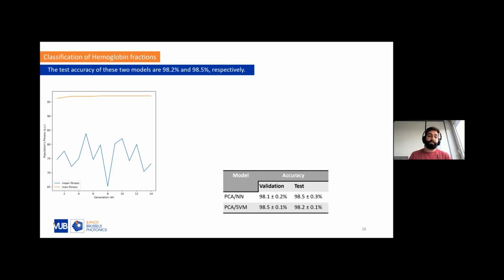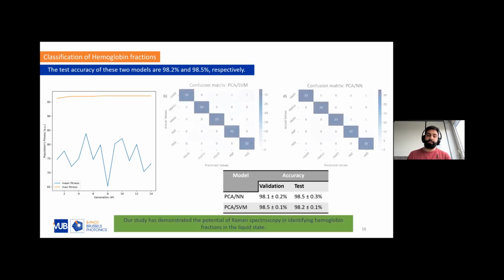So that's the case for the optimization of the models, and you can have as many models as you want, and you can have any conditions on your hyperparameters as you want. You could have text hyperparameters, integers, floats, continuous ranges, discrete ranges. All of these could be implemented in the algorithm. And then what you would get is the confusion matrices.